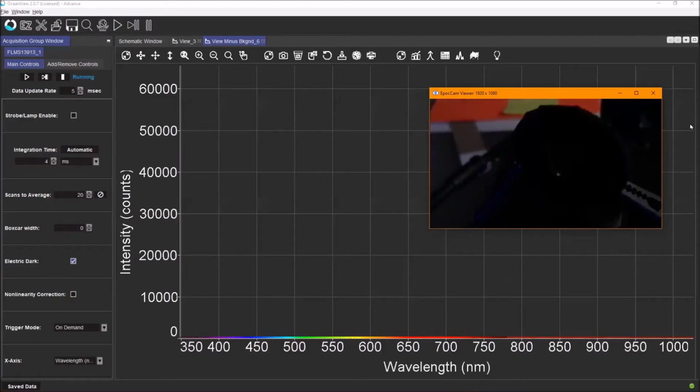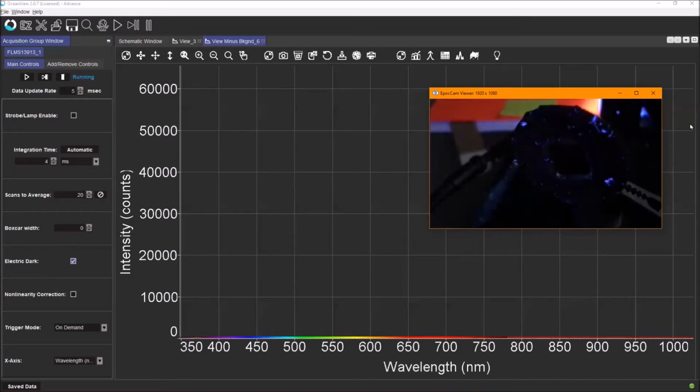Okay, let's talk fluorescence. This is when a surface absorbs light from a light source and re-emits that light in a longer wavelength while it is being lit. This is different than phosphorescence. We'll see that later. We're going to use a UV light, and that UV light is around 365 nanometers.